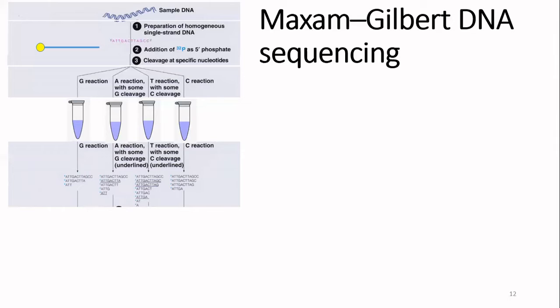In mixture number 1, there are 2 places of guanine. So as a result, there can be 2 cuts. So you can get 2 strands like this. We can observe the strand to the left because we have labeled the 5' end.